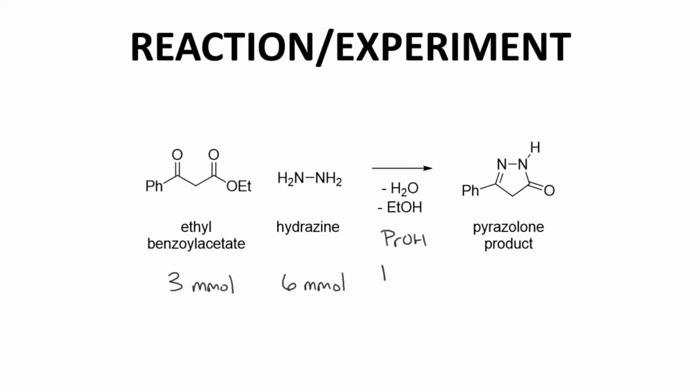with a little bit of acetic acid and heat. The product forms quickly, and we'll just add water to force it to precipitate. It's going to work great.